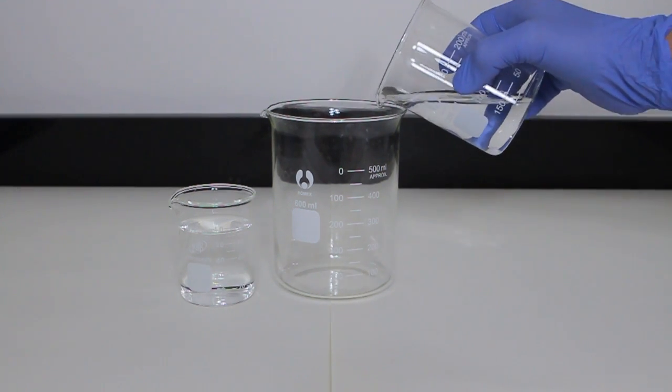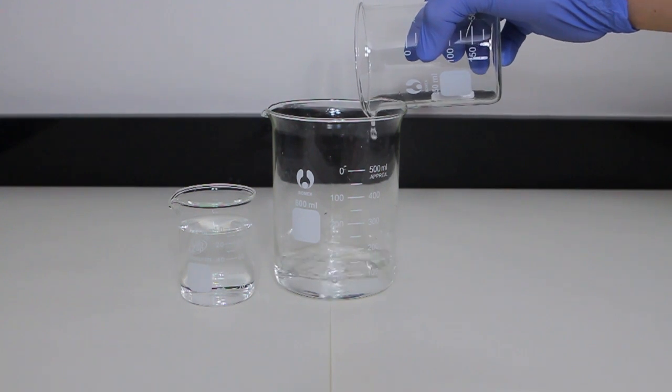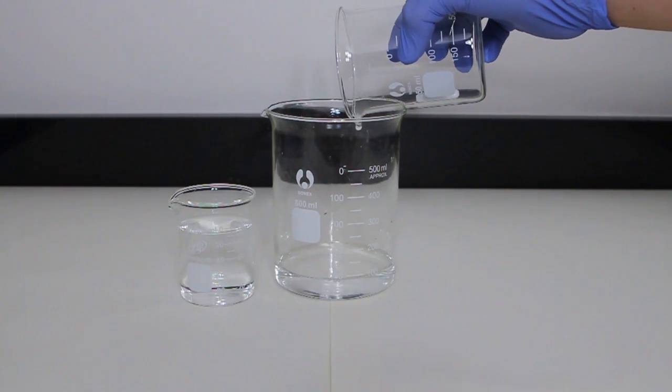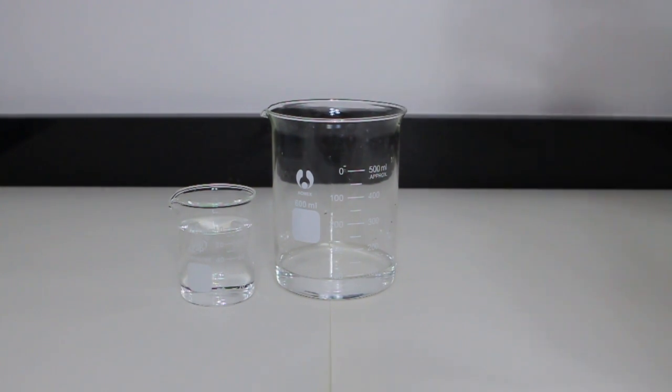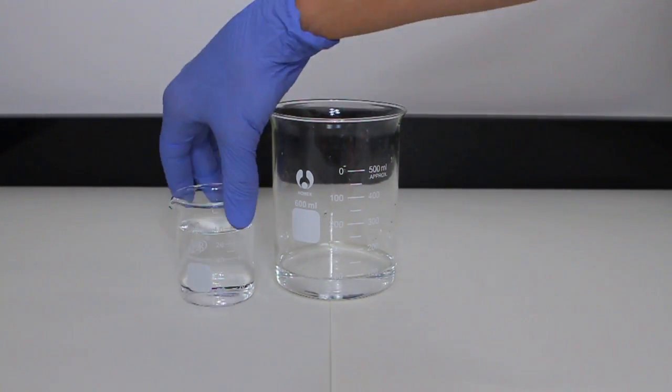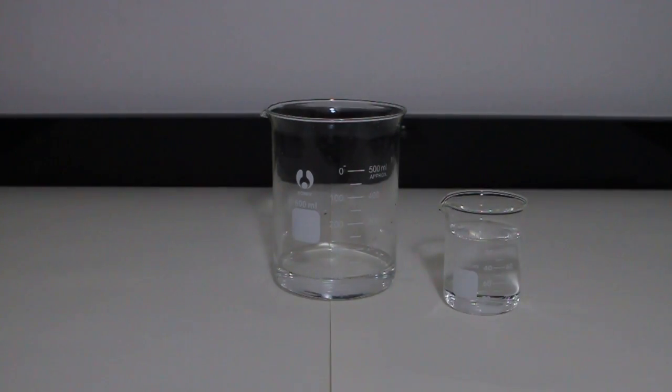The two solutions are placed next to each other, along with a large 500 milliliter beaker. I add the first solution, which contains the luminol, into the beaker, careful not to dump in the stir bar. With the 200 milliliter beaker out of the way and the second solution in position, I turn out the lights. As I pour the solution into the 500 milliliter beaker, a soft blue glow is produced illuminating the table. While light is produced, it is quite faint. It is notable how long the reaction is lasting, however.